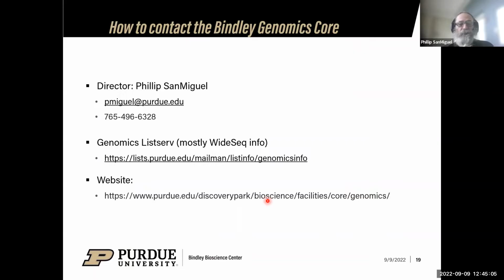Here's the reason I say I think. I had this strange result where a student from Tim Ratliff's lab, years back, took some single-stranded cDNA they made, and then did a PCR amplification on it to get a specific band, and the band popped up and looked okay to them. They submitted the entire PCR amplification to us, and we got tons and tons of cDNA sequence, just random cDNA. I don't know what's going on there. The only thing I could think was that somehow the Tn5, which I would expect to be very fastidious about whether it's jumping into double-stranded DNA or not, maybe found the heteroduplex good enough.